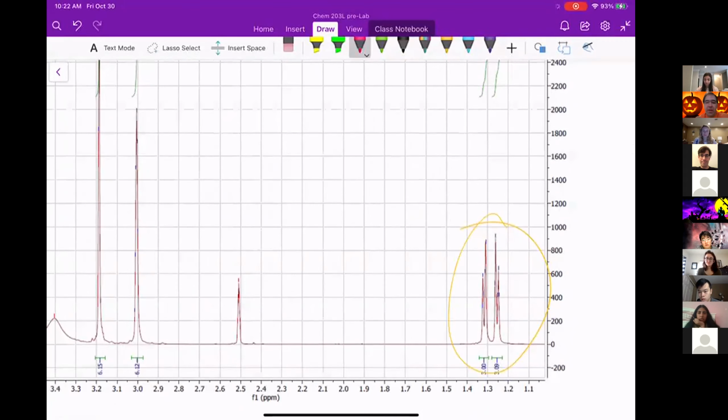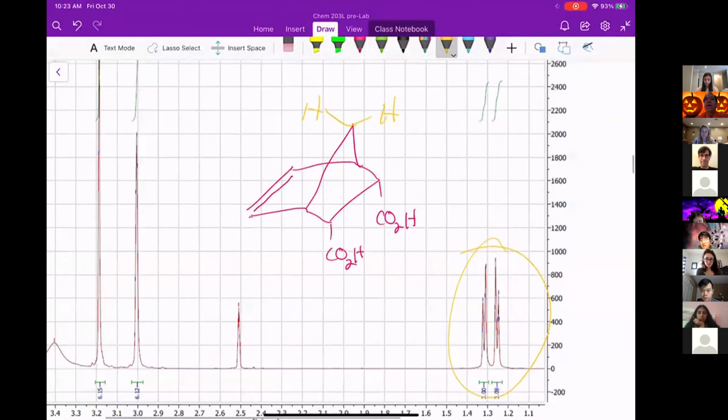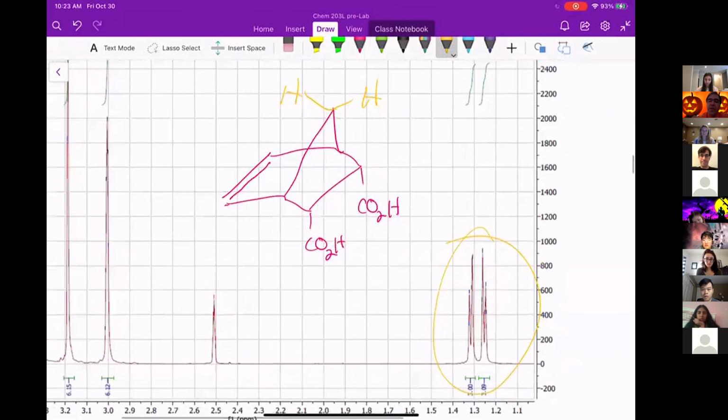So what happened? This is the first time that we have seen this, but we're going to come back to it a little bit later on today. We've been talking about chemically equivalent groups based on their nearest neighbors. But it turns out that the 3-dimensional region in space also matters. Because if you look at these 2 hydrogens, one of them is sitting above a double bond and one of them is not.